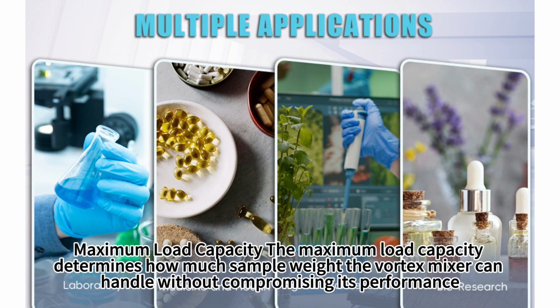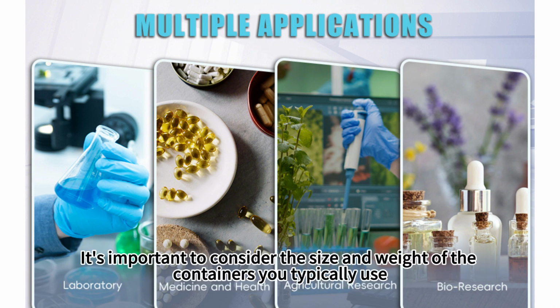Maximum load capacity. The maximum load capacity determines how much sample weight the Vortex mixer can handle without compromising its performance. It's important to consider the size and weight of the containers you typically use.